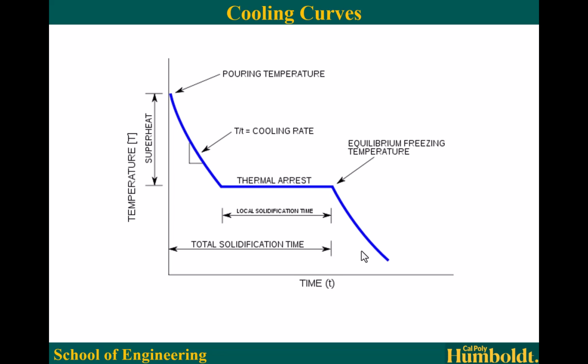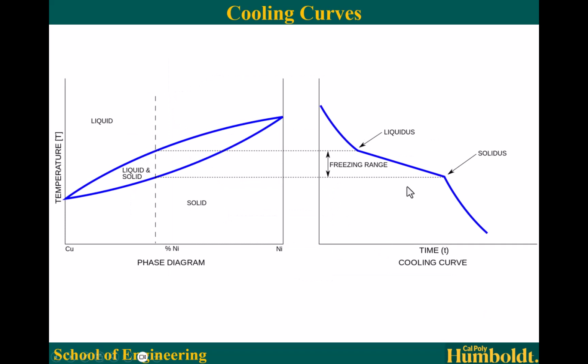So we are going to analyze these heating and cooling curves to find where, at high temperature, we're liquid, and after that, we're solid. We are going to use this then to create a phase diagram. And here's another example where you see this change in slope. It's not exactly just a straight, flat curve. Here's my heating and cooling rate, and then here's a change in slope.